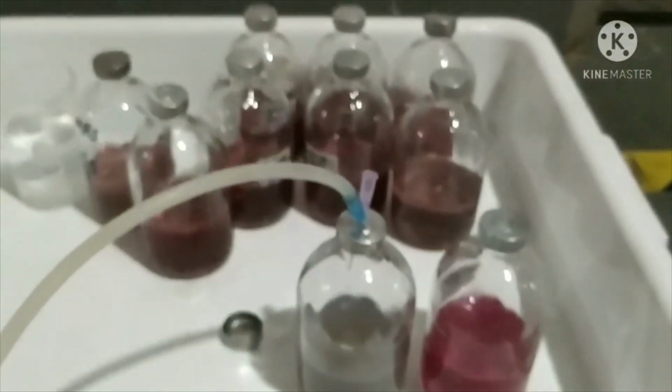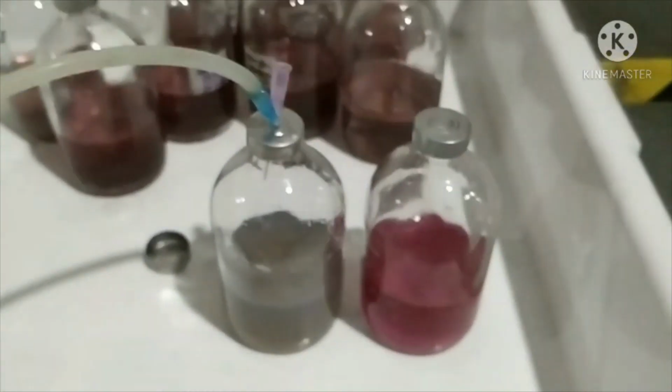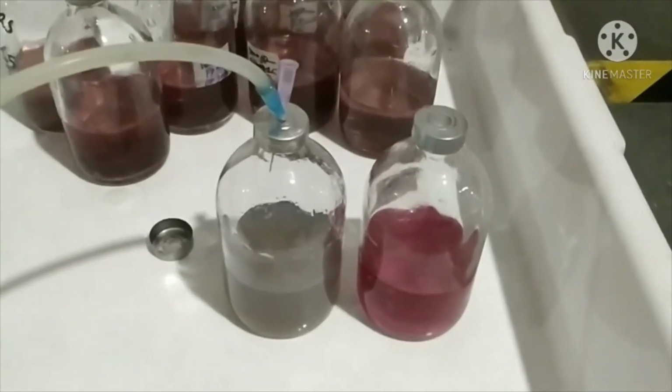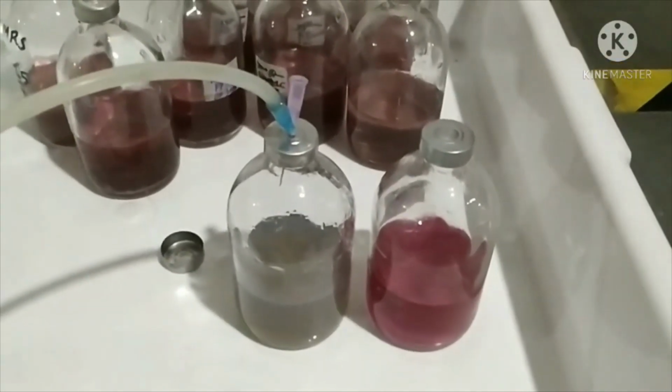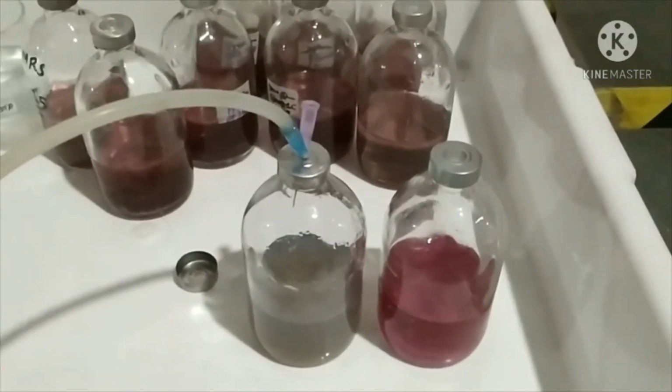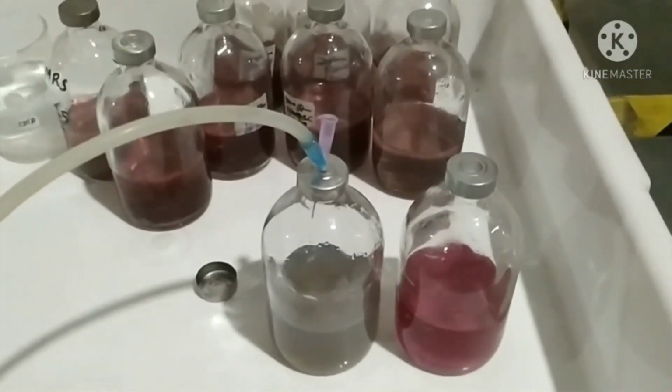Similarly, we will prepare all the serum bottles and then do the autoclaving of it, and after the autoclave we will inoculate the inoculum and then set it for incubation and see how the gas is produced by them.